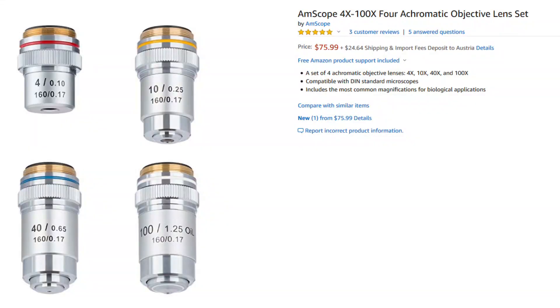And I also found on Amazon that they were actually also selling simply those objectives. So you can see that there are probably not that many manufacturers worldwide that make different microscope objectives but it's simply like this that they're manufactured in large quantities and then they're basically put on different microscopes.